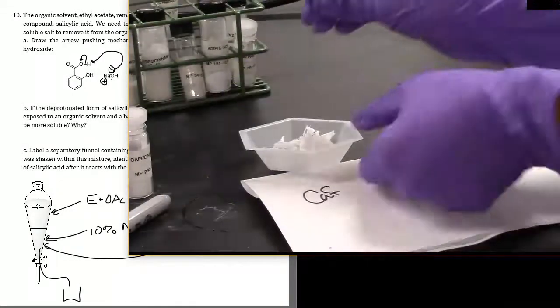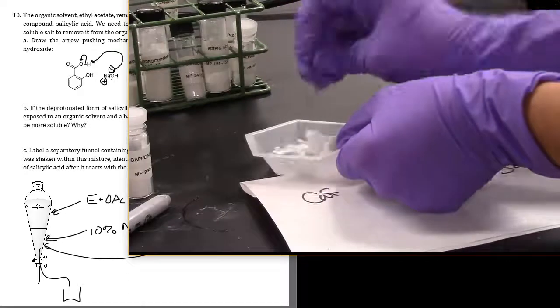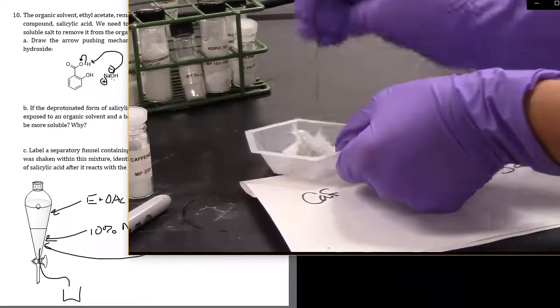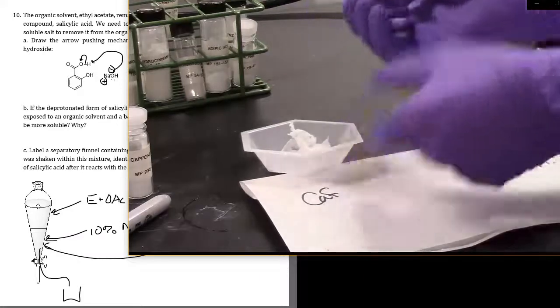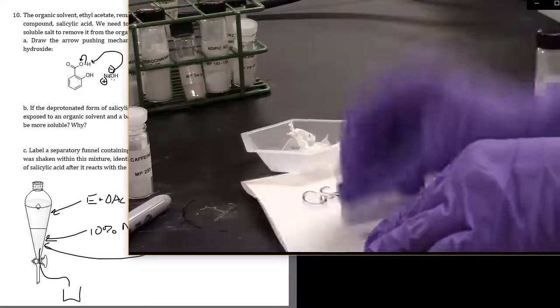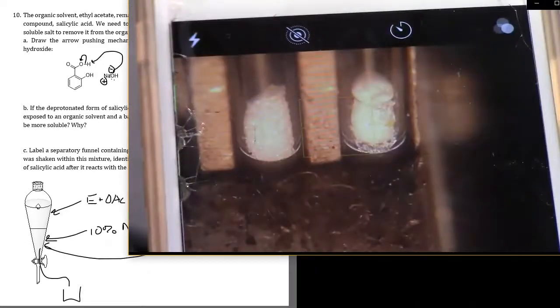So we've got our melting point standard prepared. And now we're getting some of our caffeine, and you can see we're basically puncturing holes through a small layer of crystals and a layer of paper, and it's very hard to get this actually to the bottom. We actually had to drop in a long glass rod to get it to the bottom.